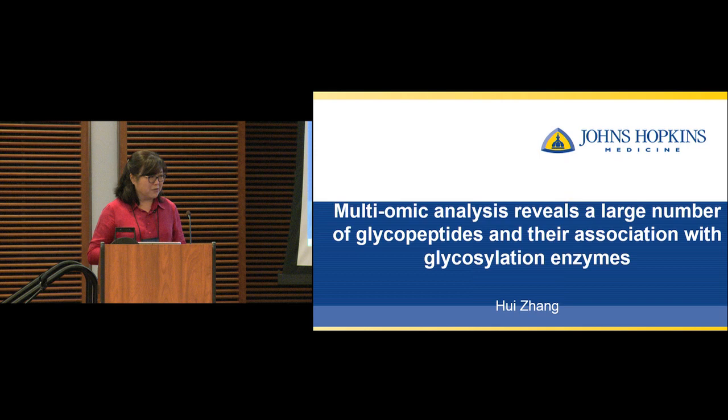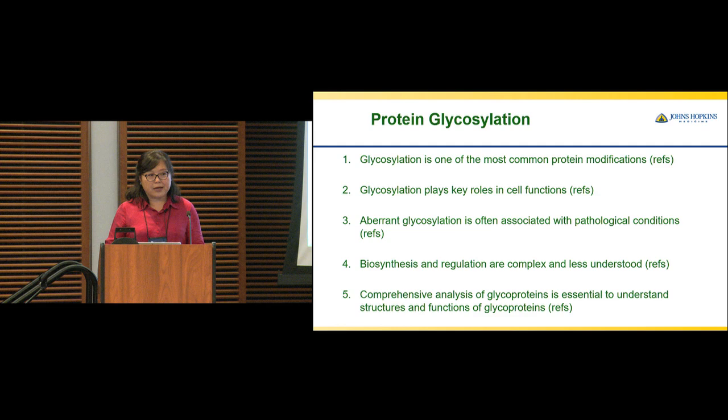I'm going to talk about the multi-omics analysis revealing a large number of glycopeptides from the global and phosphoproteomics, and their association with tumor subtype and glycosylation enzymes. So when we read a glycoproteomics paper or glycosylation paper, generally in the introduction part, there are a few sentences you often will not miss.